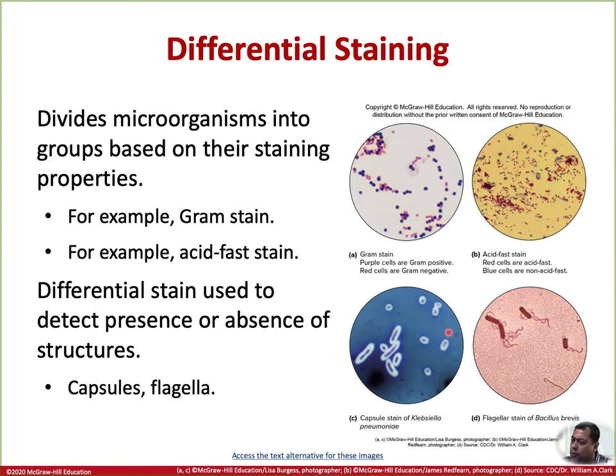With this particular negative stain, one thing you have to remember is why the polysaccharide capsule that you're seeing in white is colorless, whether you are using an acidic dye to stain the background, which is the glass slide, or the basic dye to stain the bacteria. The reason is that the polysaccharide is neutral in charge.